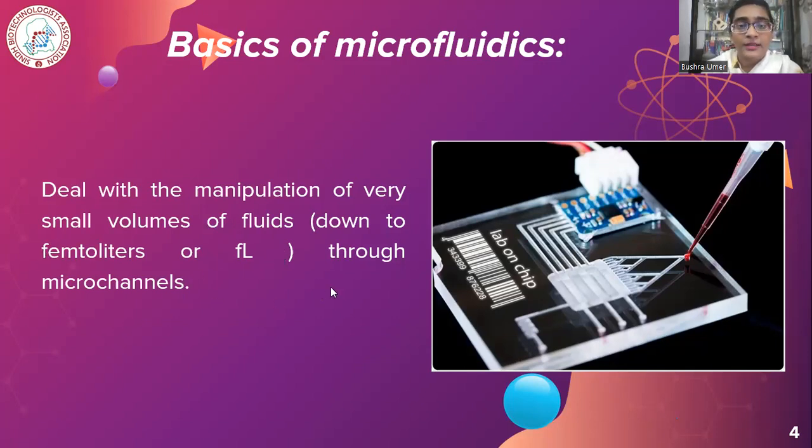As I mentioned here, we can take femtoliters of sample, where femto is 10 exponent minus 15. Such a minute quantity can be taken to perform certain kinds of experiments. So this is the wonderful thing about the use of microfluidics. And the manipulation of small volumes: we will learn what the manipulation of fluids through microchannels is.